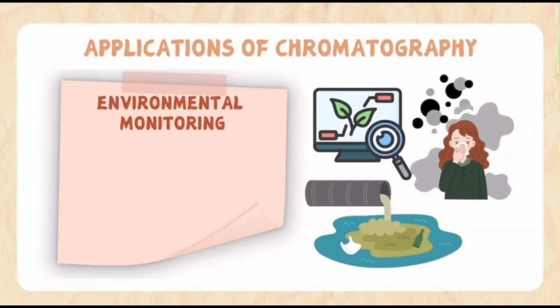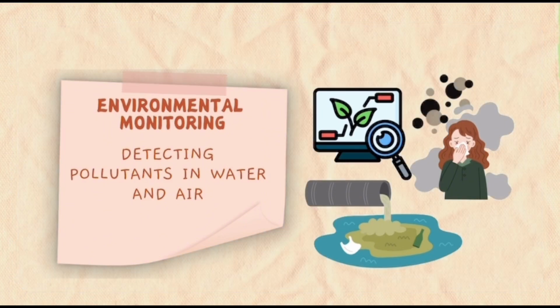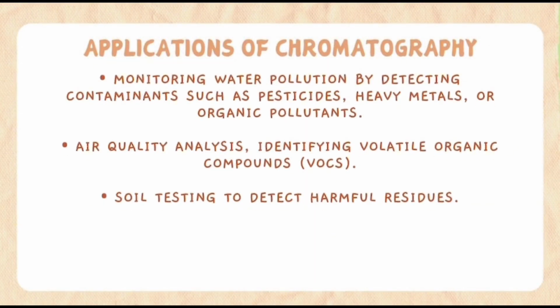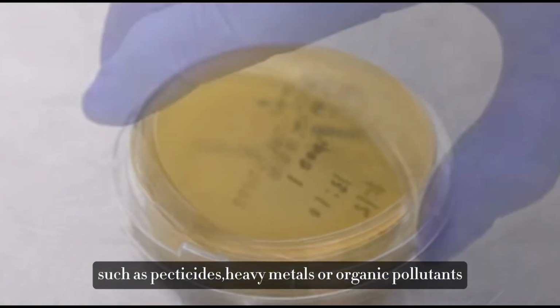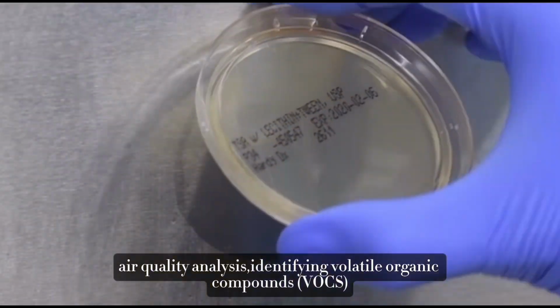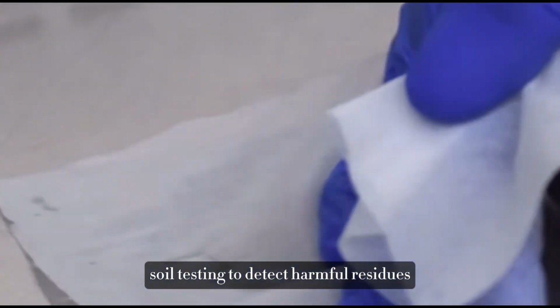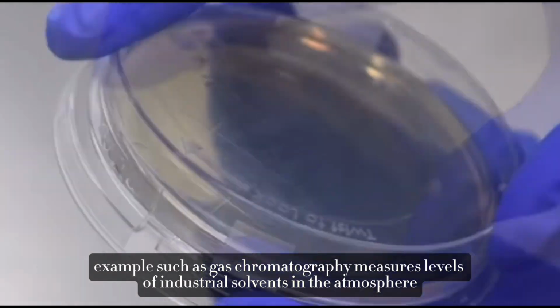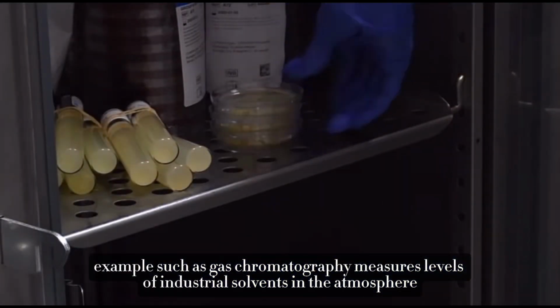Moving forward to environmental monitoring, where it detects pollutants in water and air. Monitoring water pollution by detecting contaminants such as pesticides, heavy metals, or organic compounds. Air quality analysis identifying volatile organic compounds, VOCs. Soil testing to detect harmful residues. Examples such as gas chromatography measuring levels of industry solvents in the atmosphere.